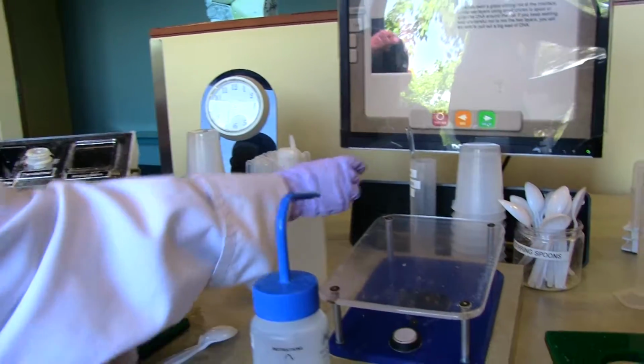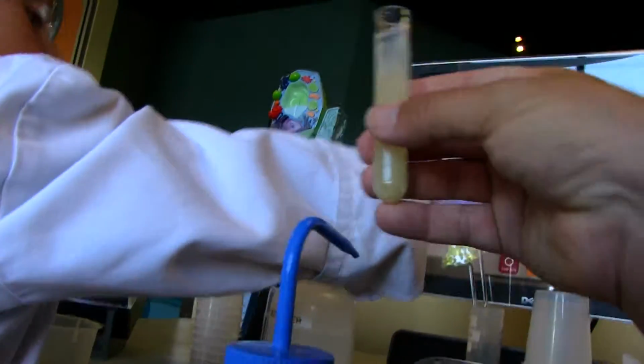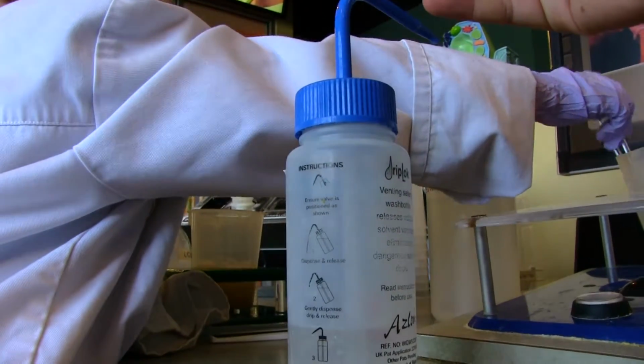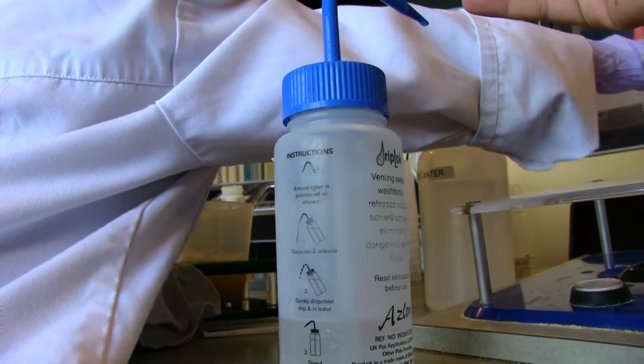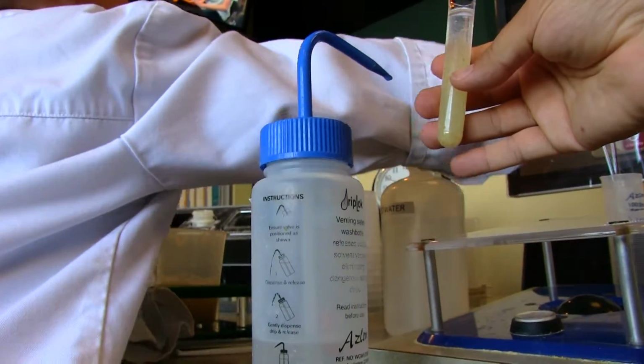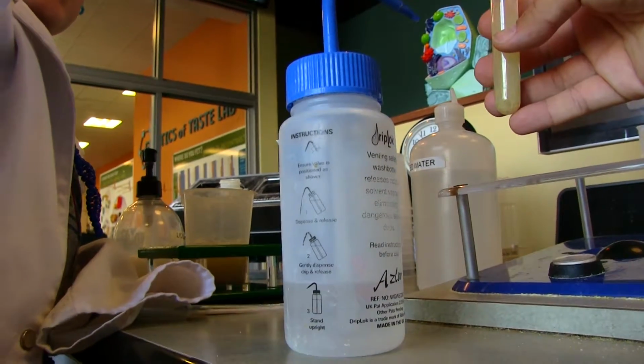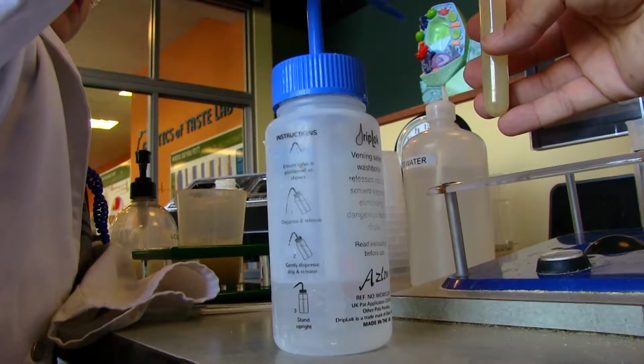Now what do we do? Okay, do you see where the 2 layers are? Where one layer starts and the other layer ends? If you keep swirling right there and are careful not to mix the two layers, you will be able to pull out a big wad of DNA. Now what do I do? Do I use this? Swirl it real slowly. Right there. Swirl real slowly.